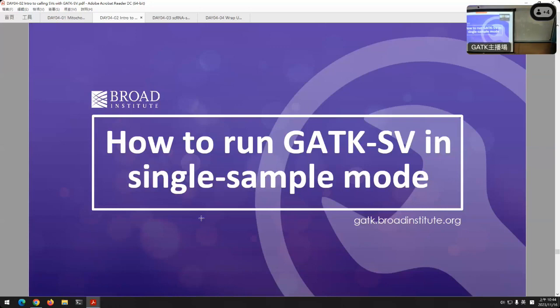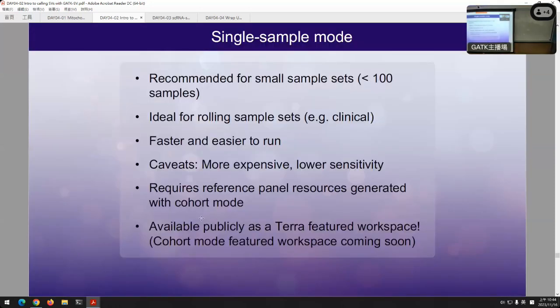Okay, so hopefully I've convinced you that GATK-SV is a useful pipeline. Maybe you want to run it. So how can you do that? We're going to talk about running GATK-SV in single sample mode. This is where you run GATK-SV on one sample at a time.